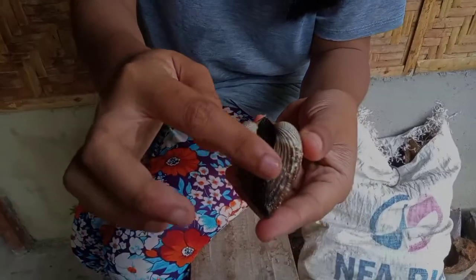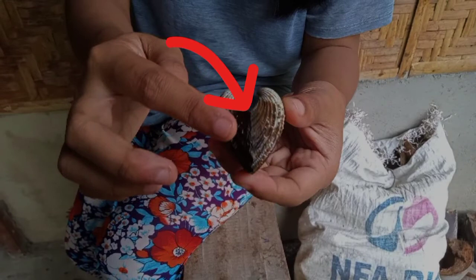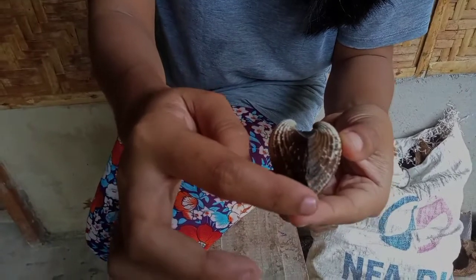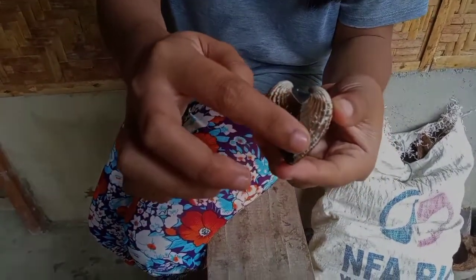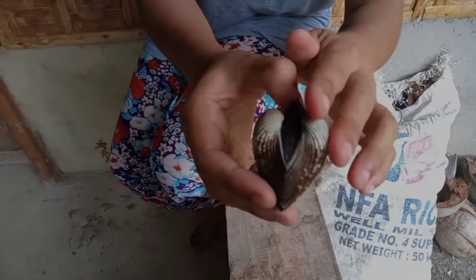The dorsal. Dorsal is the side or edge with the umbo. The more dorsal opening is the excurrent siphon, where waste and water leave. This one is the ventral. The lower or bottom edge of a shell. The ventral tube is the incurrent siphon that carries water into the clam, and the more dorsal tube is the excurrent siphon, where waste and water leave.